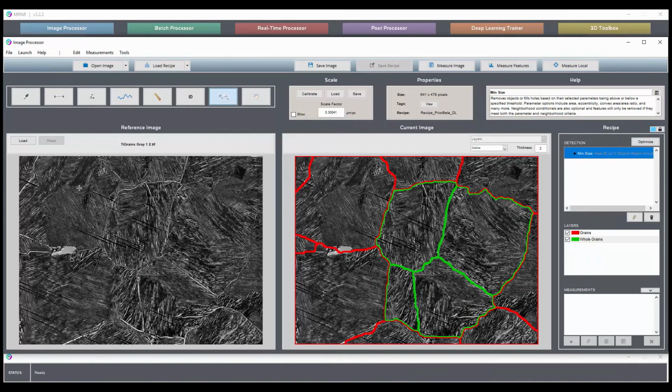And even with these deep scratches and boundaries like this, on an image that was not part of the training set, I would say that this algorithm learned remarkably well how to detect what not too long ago I thought was an impossible problem to automate.